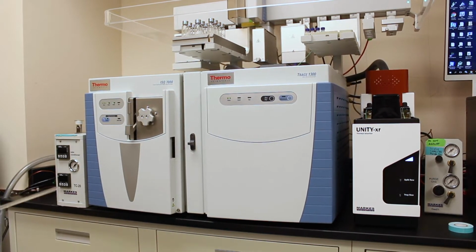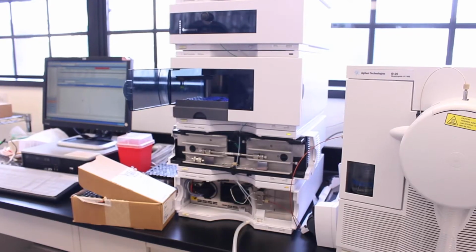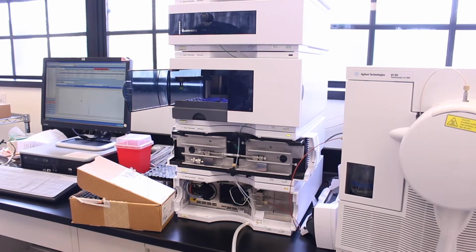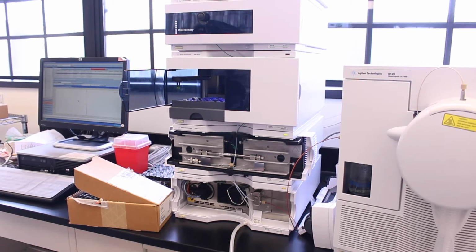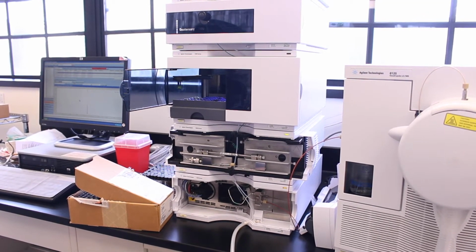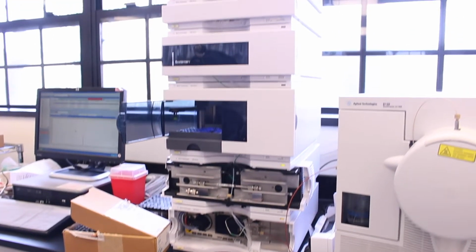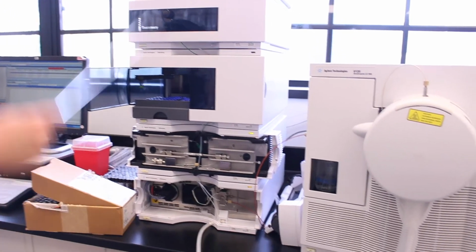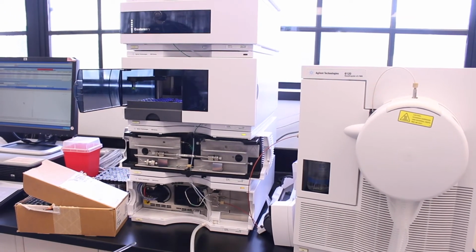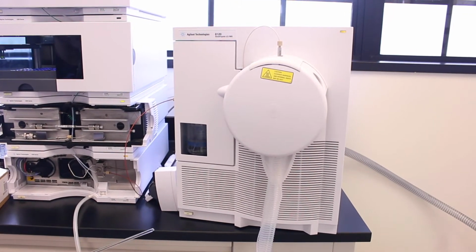All right, so now we're going to go take a look at the second form of mass spec we have here at Chaminade, and that's in the other room. All right, so now we're in the other lab, Lab 0, and this is the room that houses the LCMS. So LCMS is similar to GCMS. Instead of gas chromatography mass spectrometry, this is liquid chromatography mass spectrometry. Just as before, there are two main modules. The left system is the LC, the liquid chromatograph, which we'll talk about. And the one on the right is the one we're more concerned with, which is the mass spectrometer.